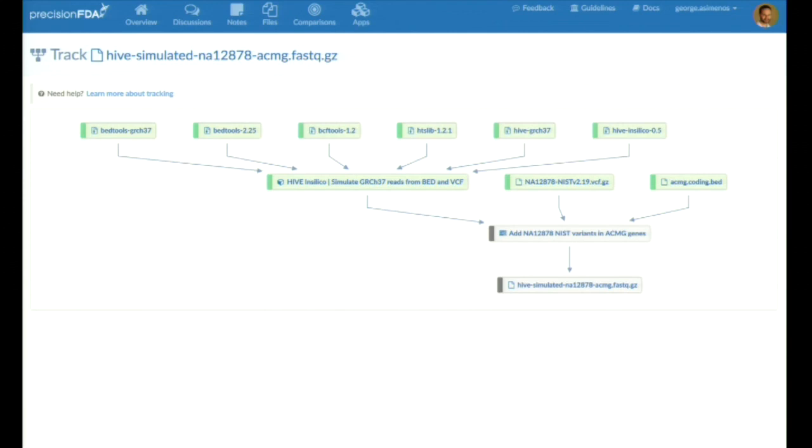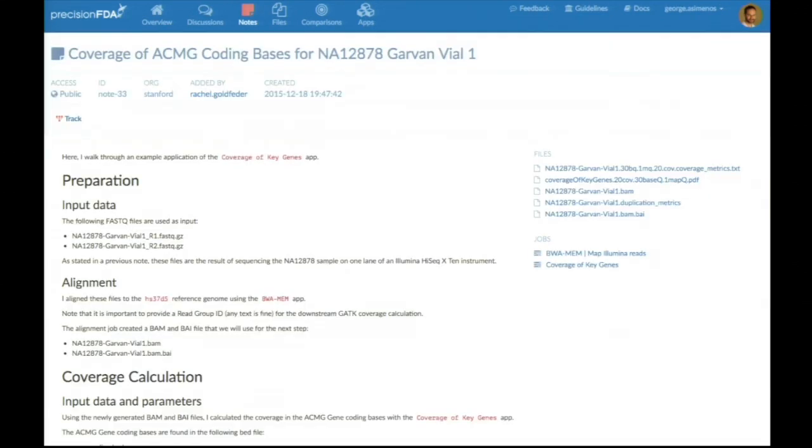Finally, when they're done with all their experimentation, they can tell the world about it by creating a note. This is an example of a note using rich text where someone describes what they've done, and on the right-hand side, they've attached artifacts such as files, or jobs, or even apps and comparisons on PrecisionFDA.